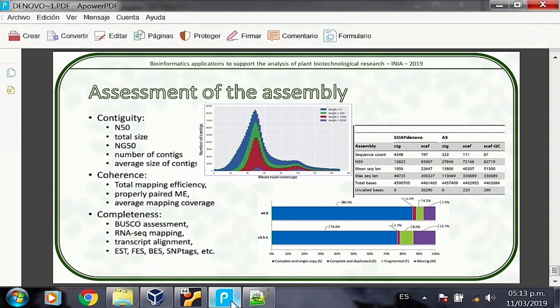So the next time you sequence a mammalian genome, you'll go to that data set and check if those genes that are in the data set are present in your assembly, and the more of those genes are present, it is an indication that your assembly is more complete in the gene space. There's definitely going to be a difference in the nucleotides.